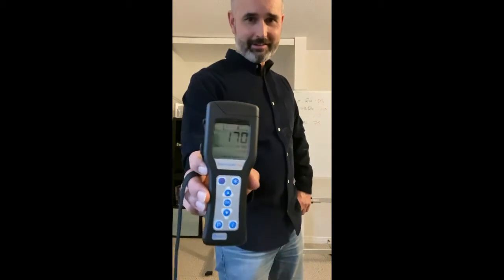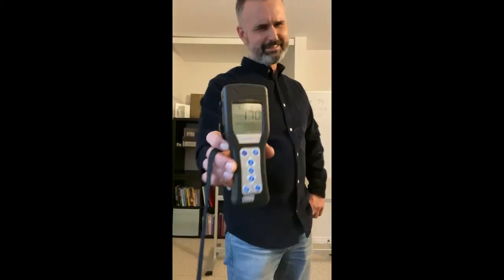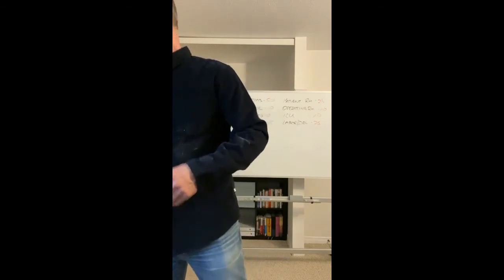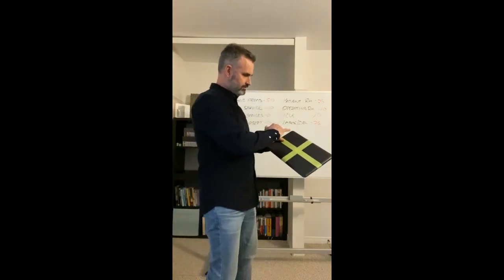So we're going to jump onto the laptop, which I'm really looking forward to showing you guys the results of cleaning and disinfecting. And oh, not bad, actually 170. So I'd say it's not terrible. 170 is not bad actually. I mean, it's right against my face.